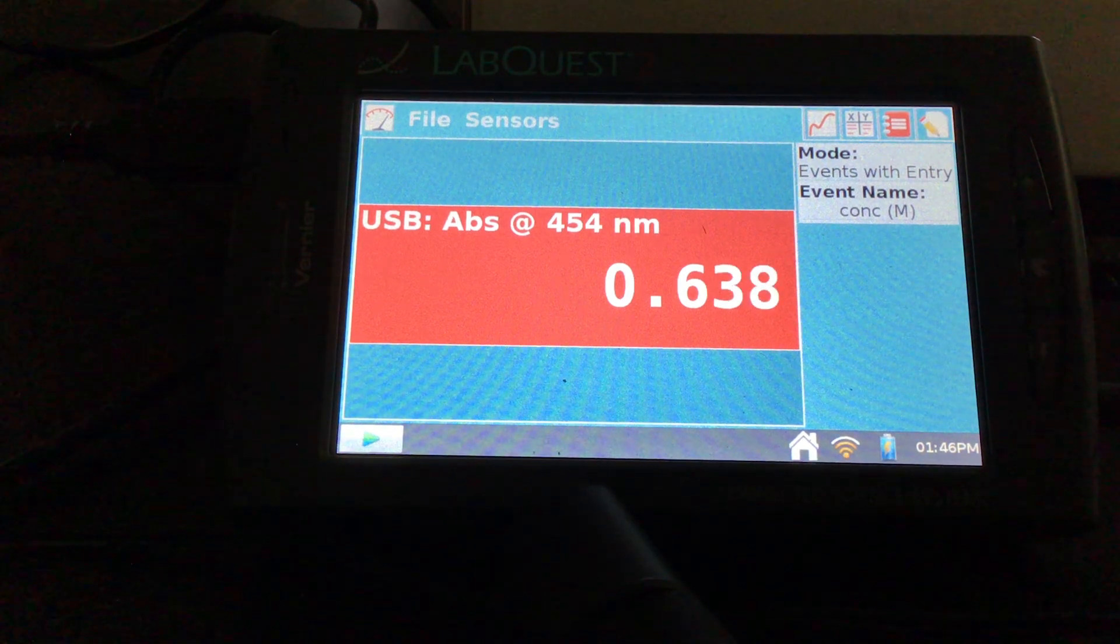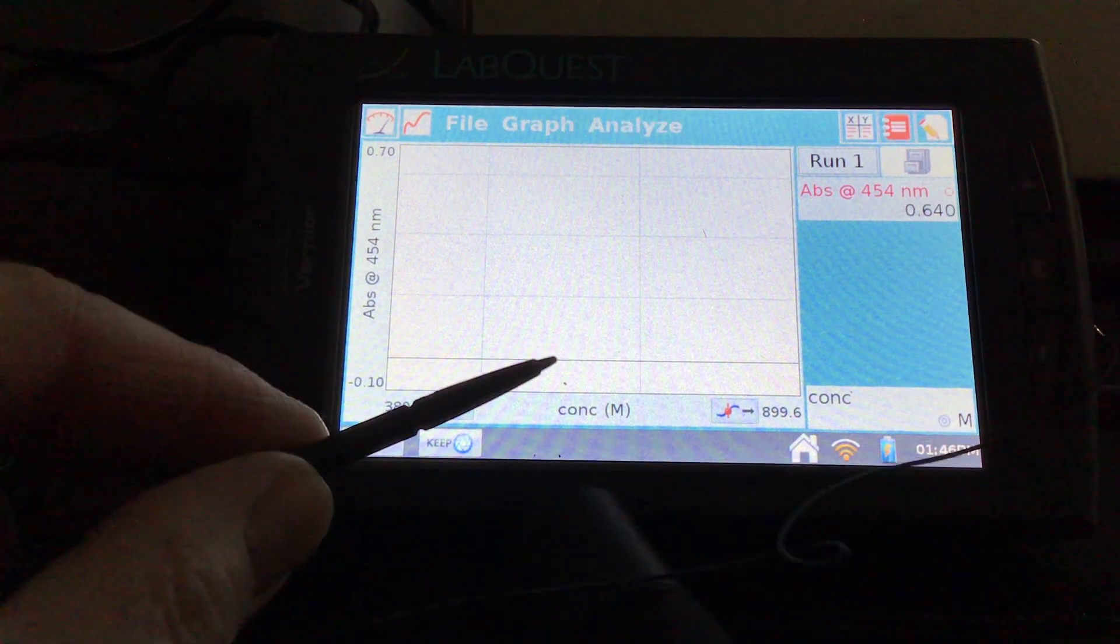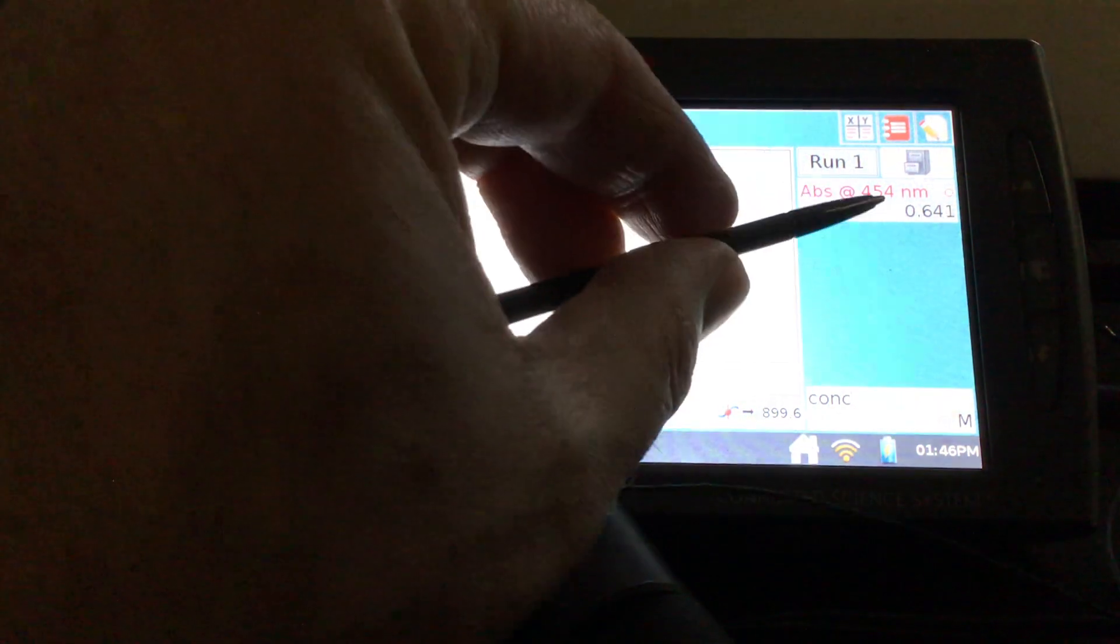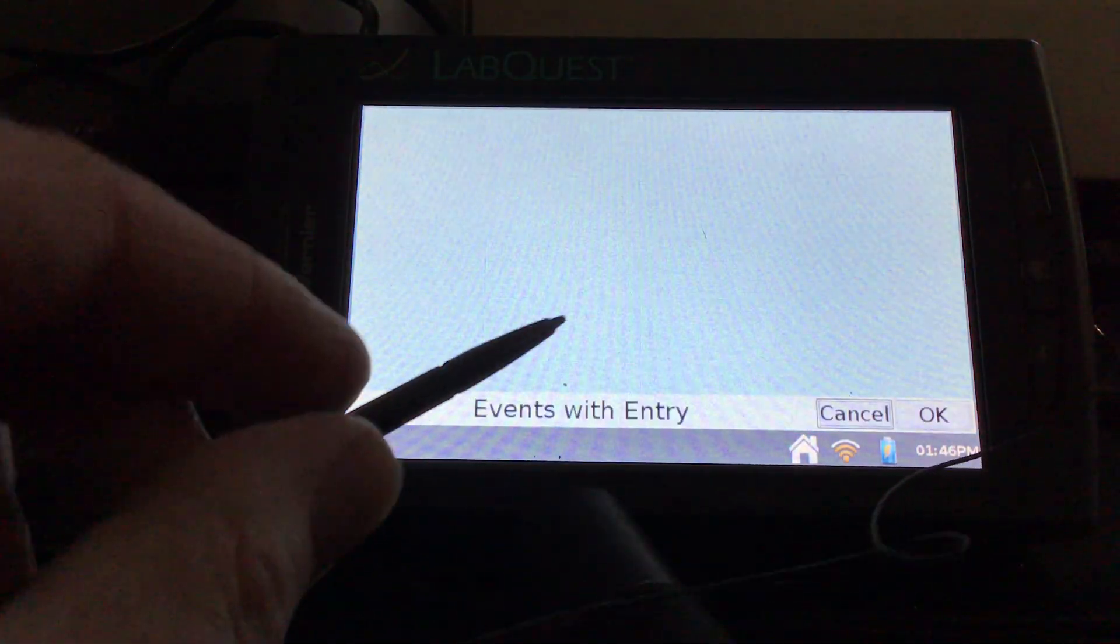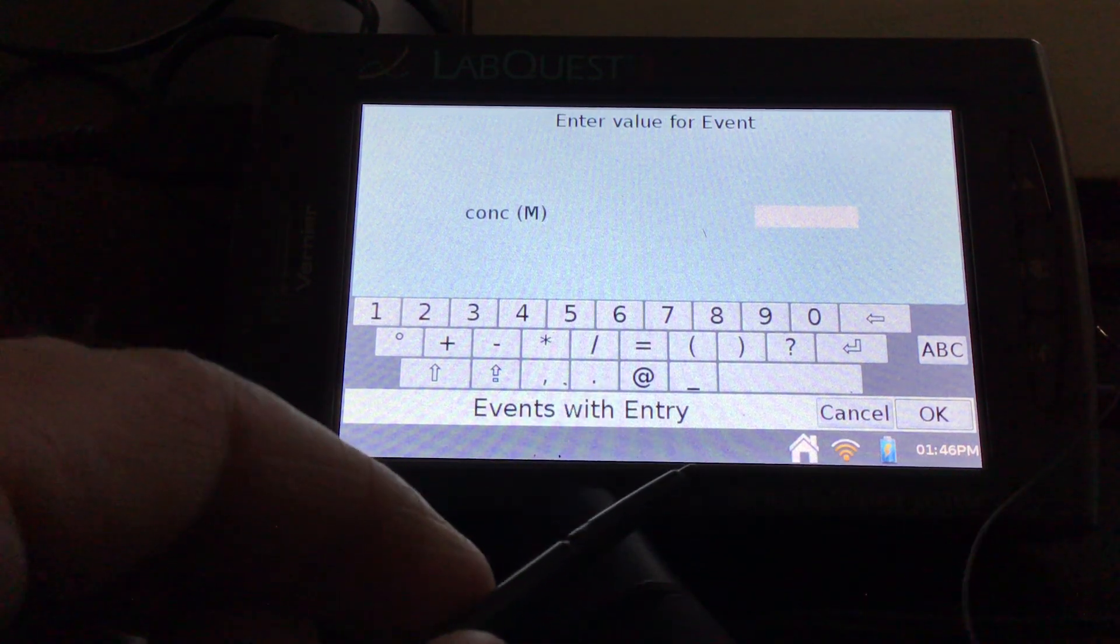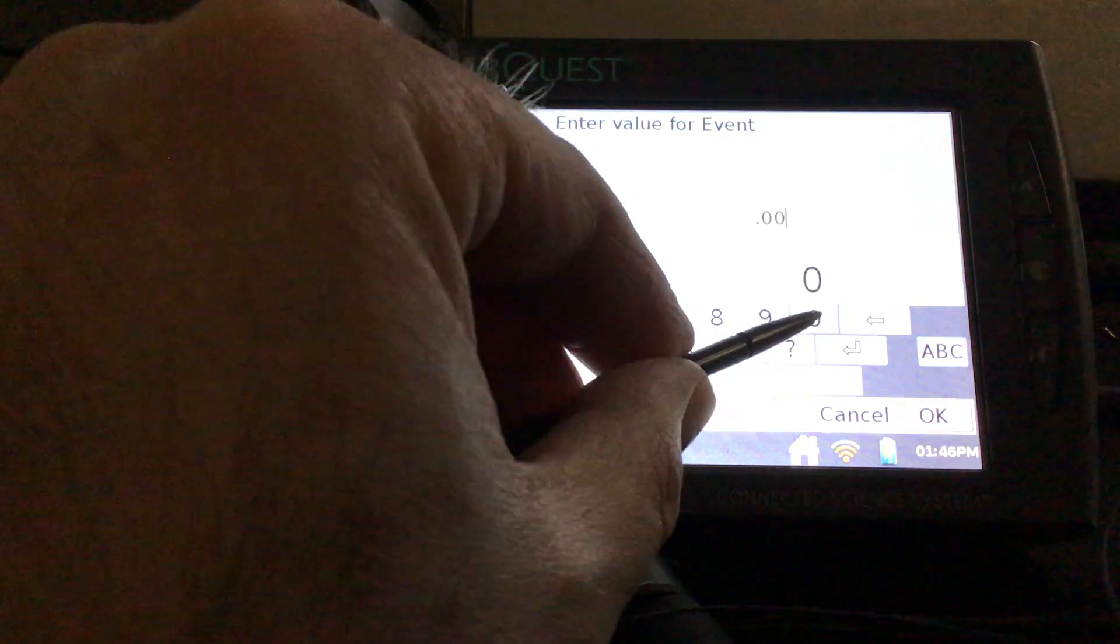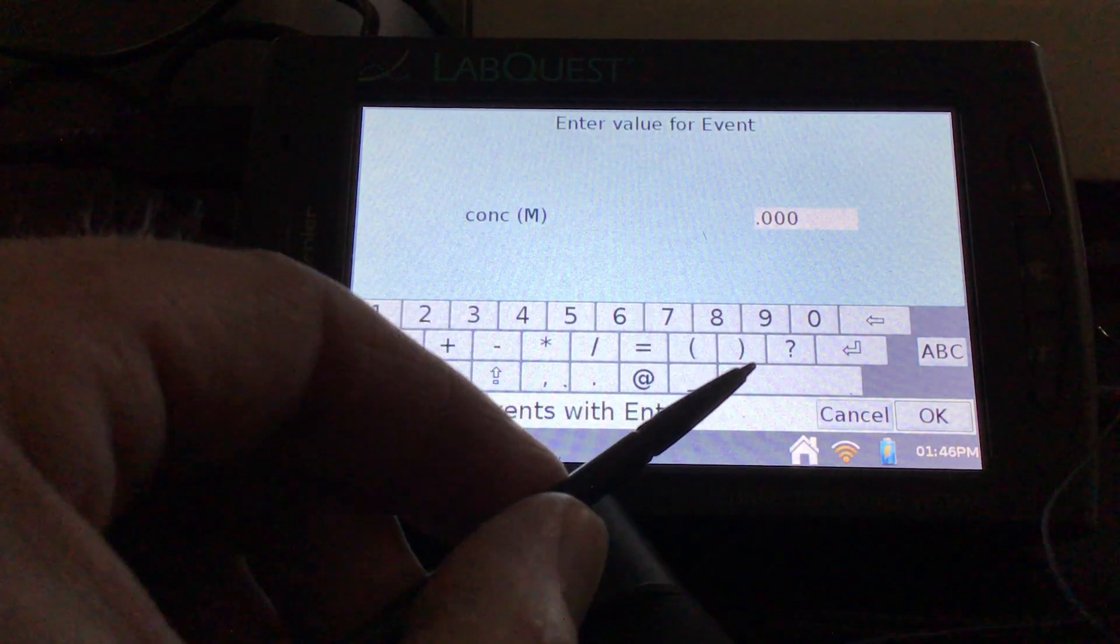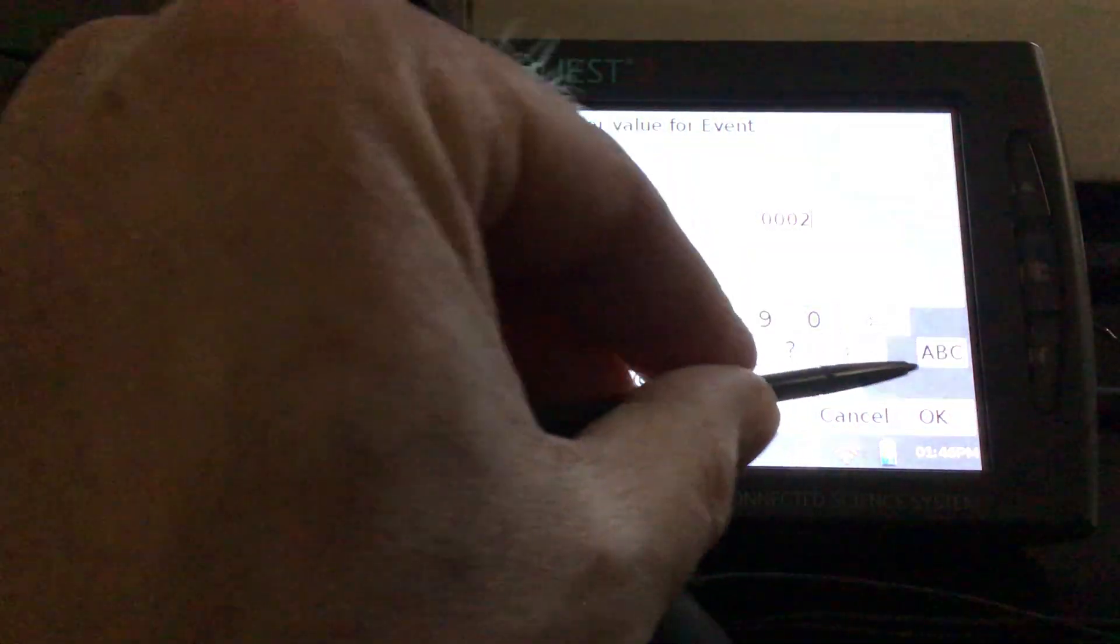So I'm going to start collecting data. And then once my absorbance stabilizes, which is pretty much around 0.64 up here in the upper right, I'm going to hit keep. And then I'm going to enter my concentration. You want to do this in a decimal form, not in scientific notation. So this concentration is 2 times 10 to the negative 4th. So it means there's three zeros, three zeros, and then our two. And we'll hit OK.